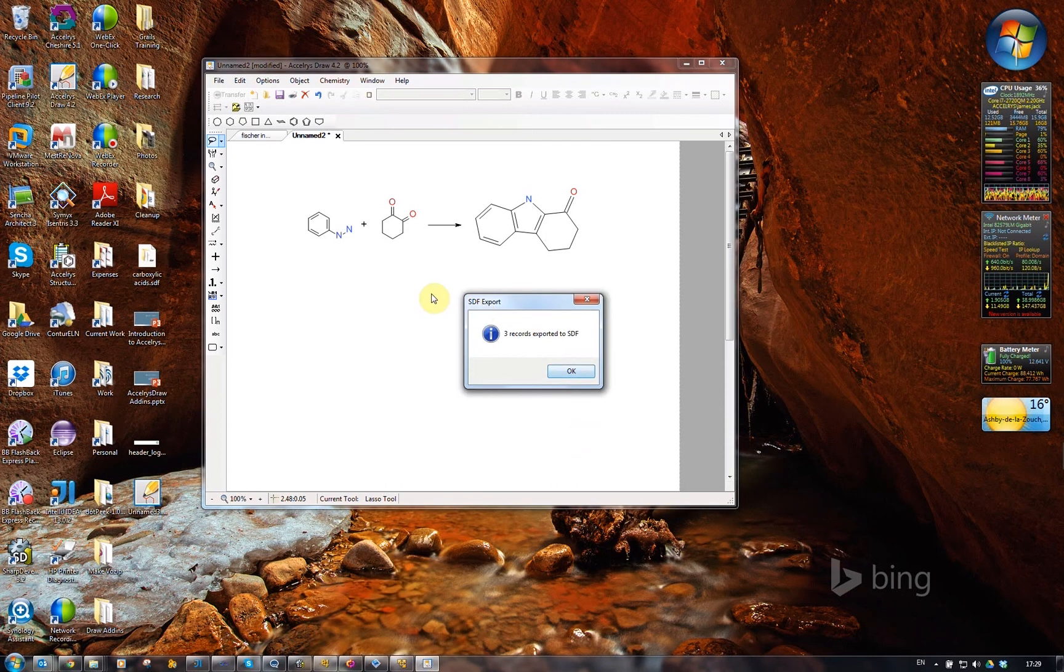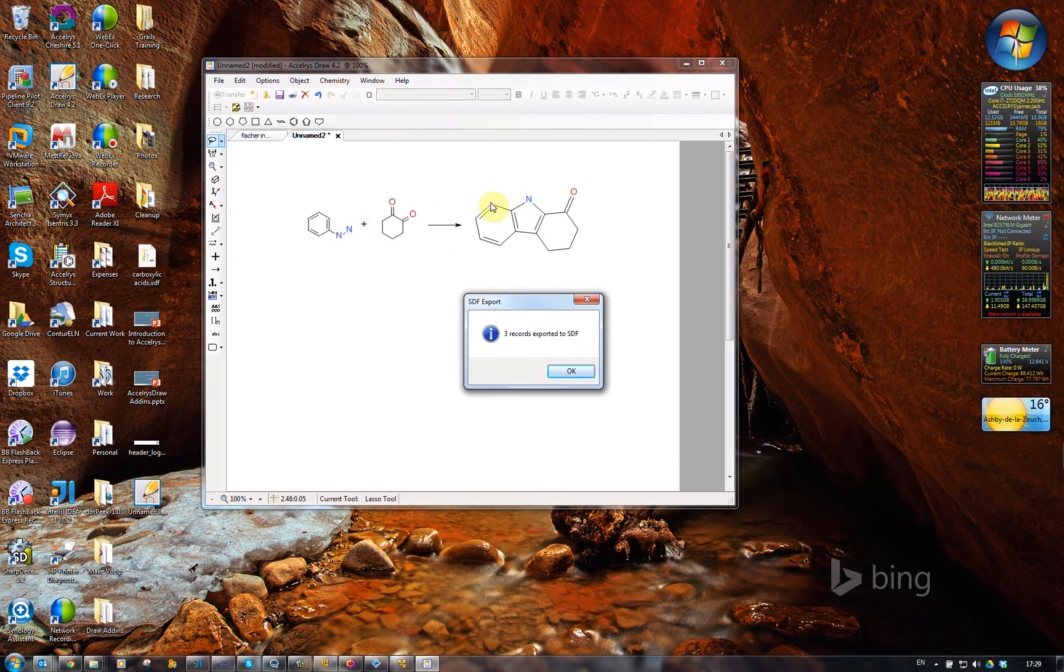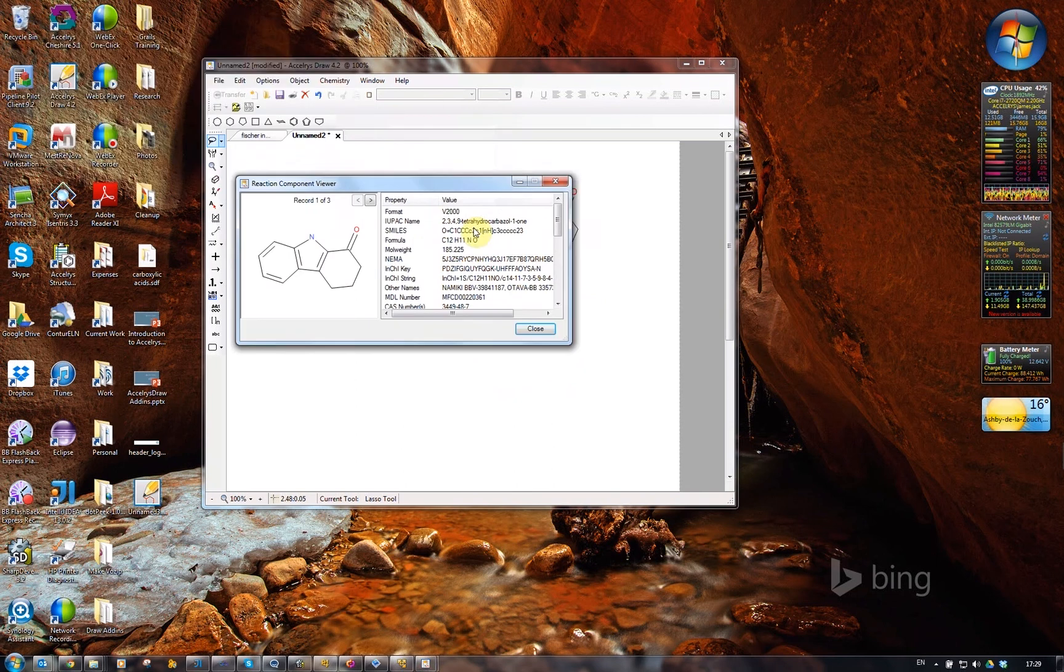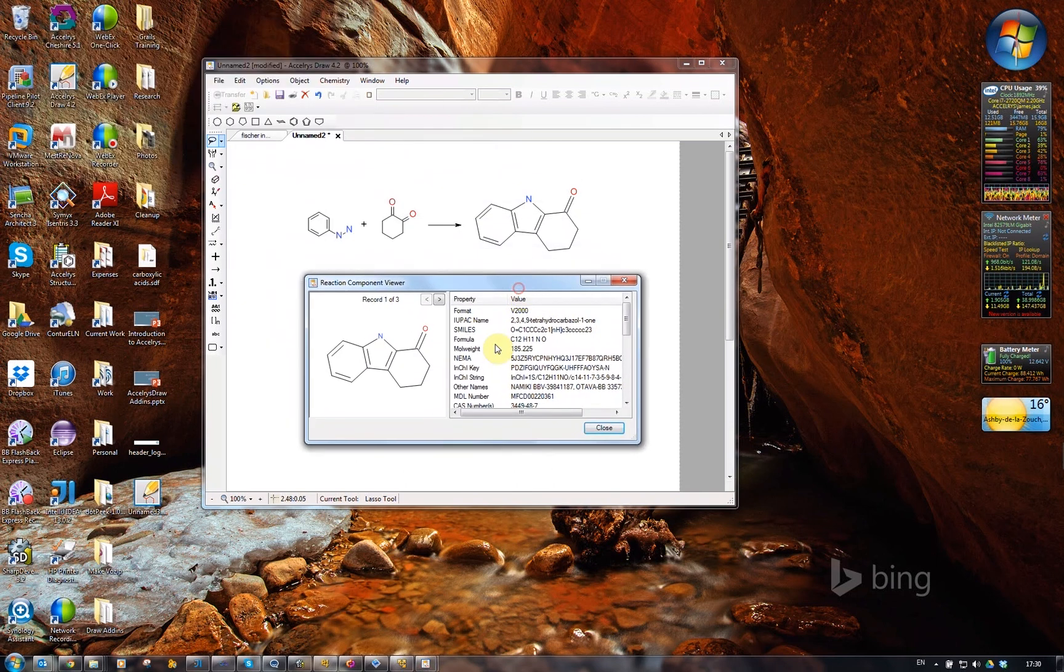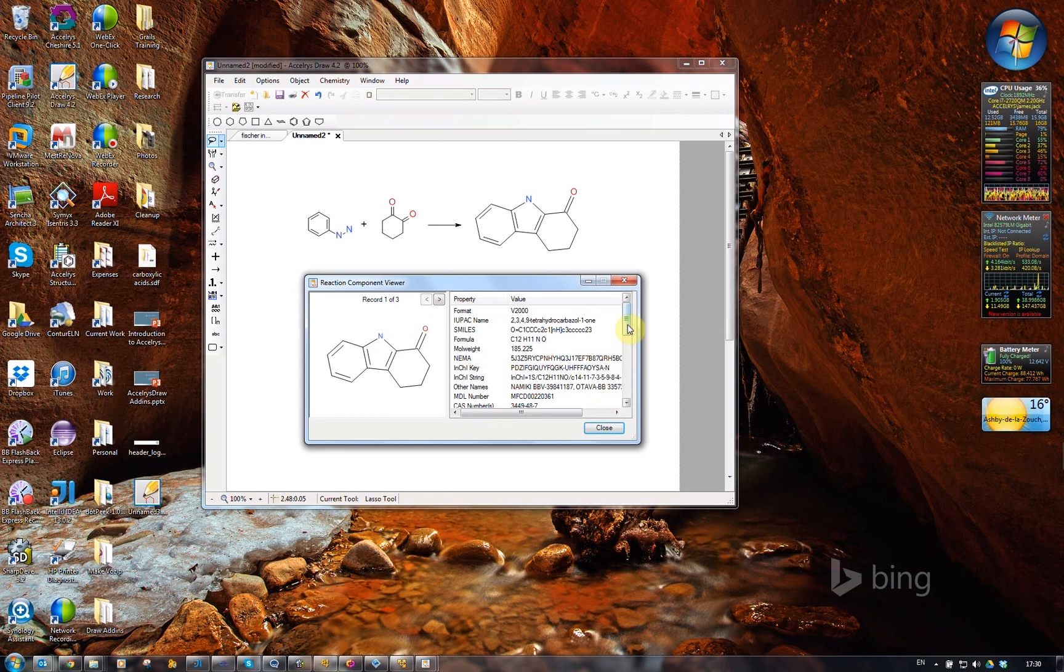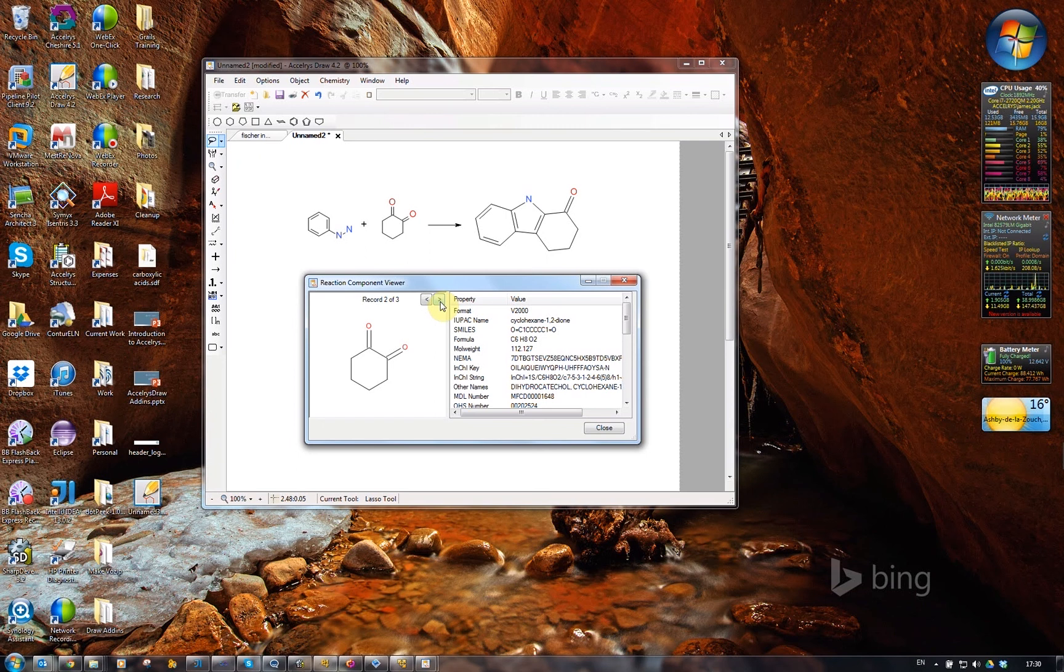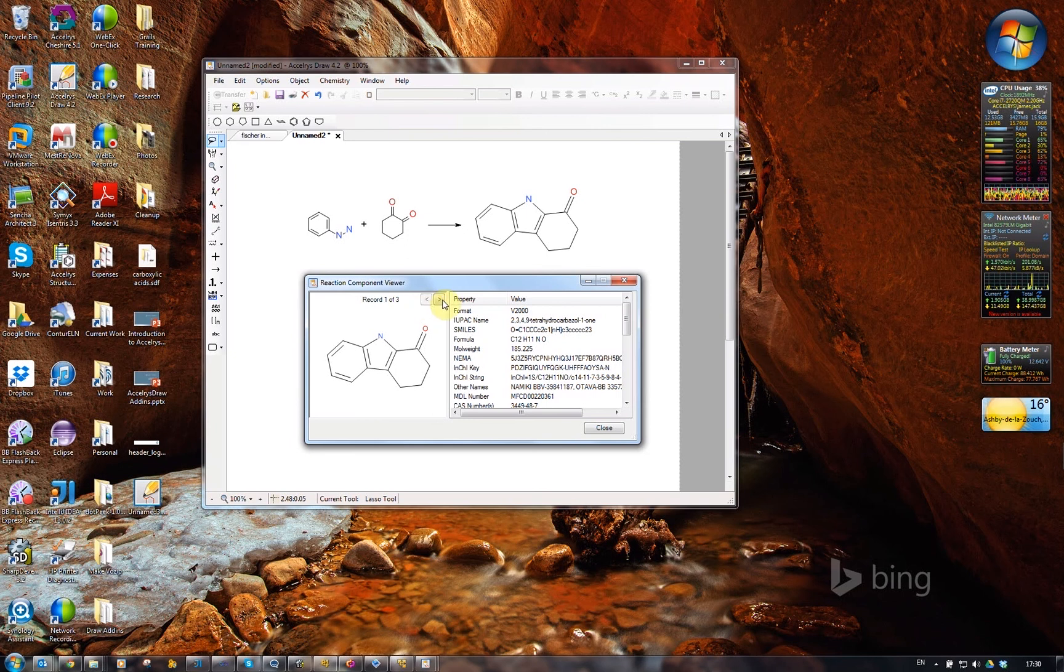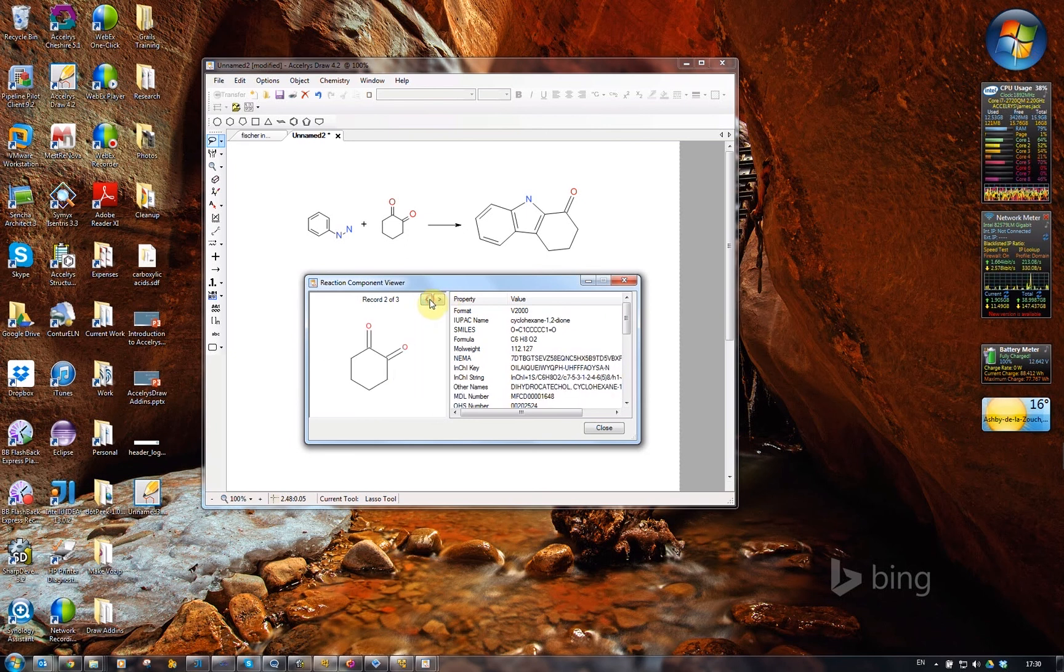It's figured out that there are three components in this reaction, two reactants and one product. It pops up the reaction component viewer. I can look at the different properties. It generates some data, again, using things like the DiscoveryGate lookup.